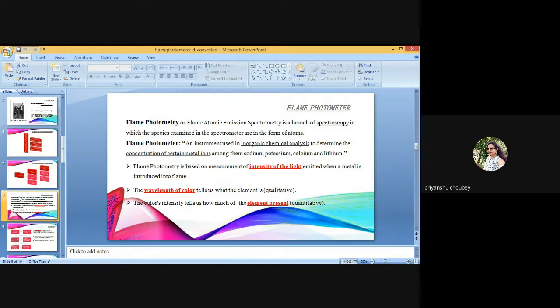Each module automatically performs a different function in the analysis.